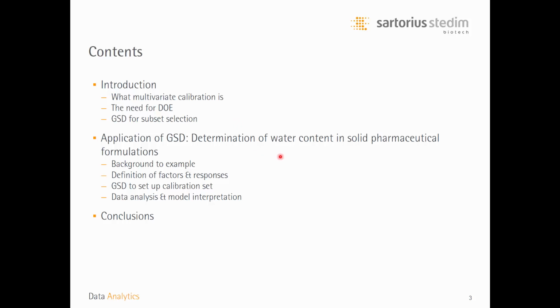This brings us up to the main application, which deals with determination of water content in tablets. We will have a full account of the application, the background. We will walk through all the stages relating to setting up factors and responses, use the generalized subset design entry in the MODDE software to accomplish the final DOE, and we will also have the data analysis and model interpretation stages being reviewed.